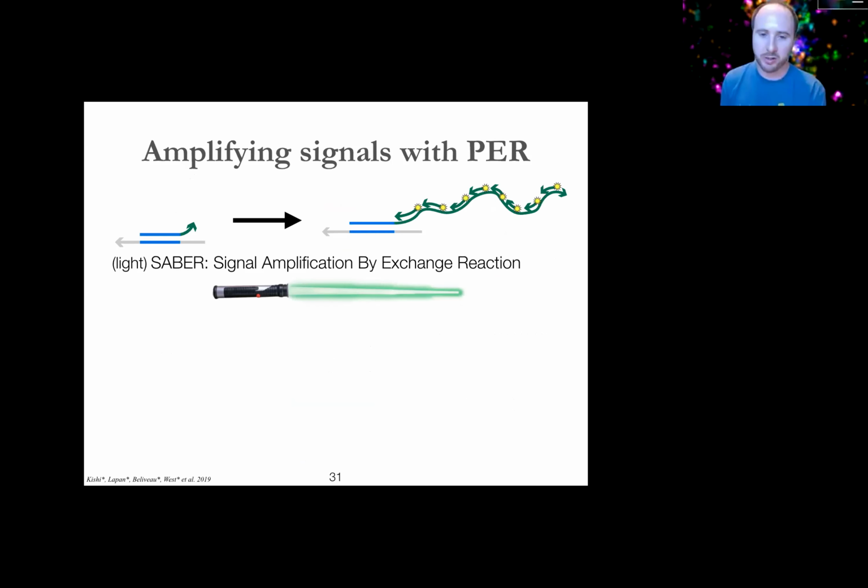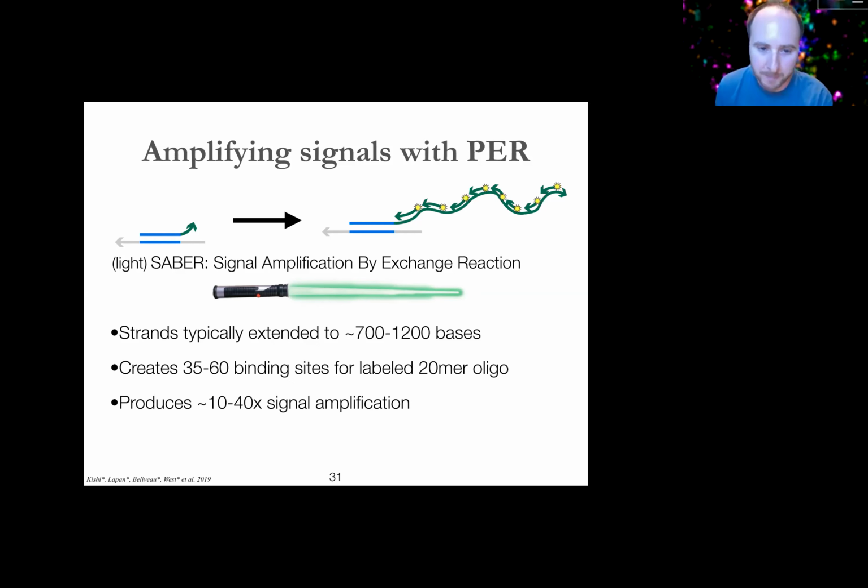And kind of the joke here is we're taking oligos and extending them to make them bright. It's kind of like illuminating a lightsaber. So practically what we're doing is we're extending either probe oligos themselves or the secondary oligos I described earlier in the talk that can bind to probes that are docked at the sites of hybridization by 500, 600, 700 bases, maybe a bit over a kilobase, depends a little bit on what you're doing.